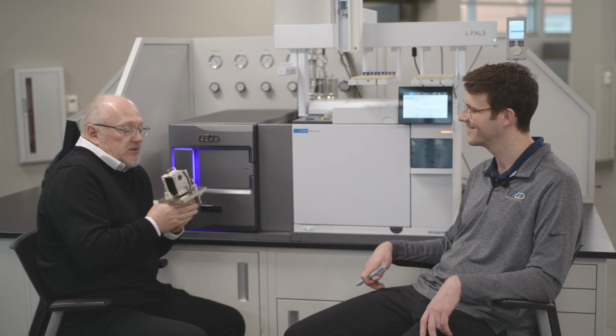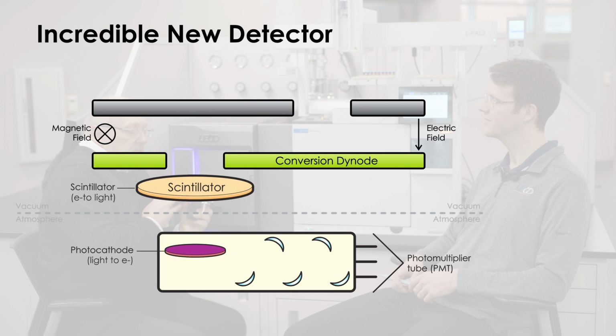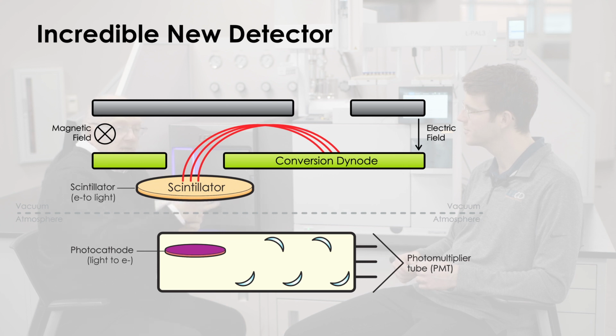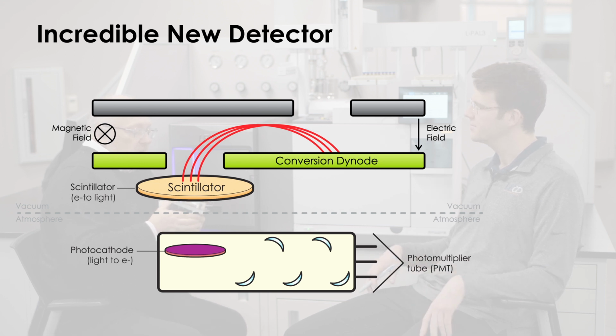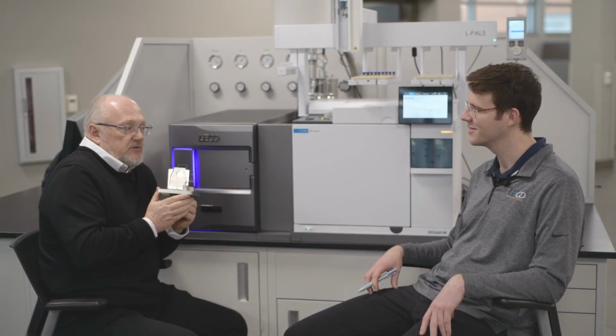And as a result, this is a detector which is installed in our BTX. So it's a hybrid style detector. Ions will strike the conversion dynode, and during this strike, secondary electrons will be created, and they will be turned around in a magnetic field. The electrons then will strike the scintillator, a very fast scintillator, which was also quite a significant technological advance which our partners provided to us. While striking the scintillator, those electrons will create photons, and photons will be detected by a photomultiplier. The combination of those parts gives us a very robust detector, which is what we were looking for.